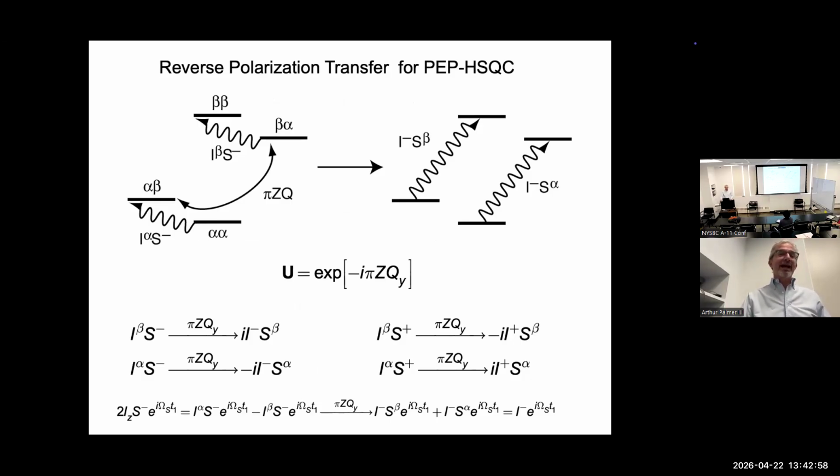It was almost an accident because I had come to learn NMR. I'd never done NMR before being a postdoc. And Mark Rance and John Cavanagh had worked out a way to recover both components in an HSQC-type experiment. And John gave a group meeting about this and said this works because the signal is cosine modulated.